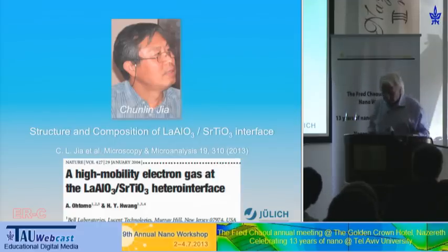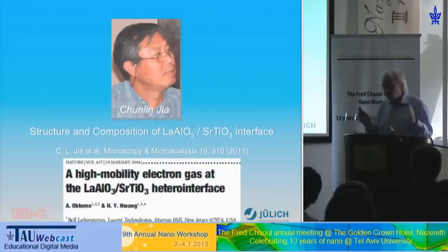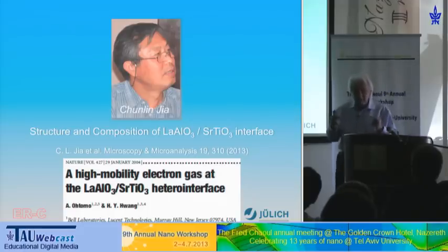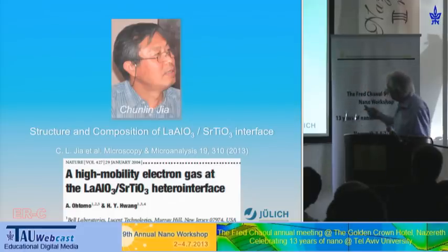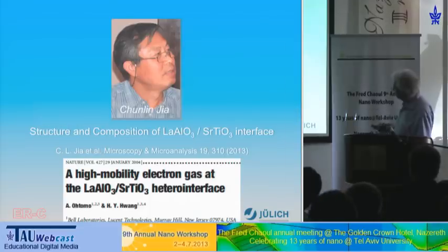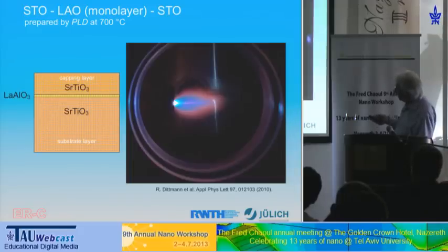So people have done a lot of work. There are hundreds of publications on this effect, but still there is no full agreement on what is behind this. Part of the reason is that people were not able to measure the properties on the atomic level. So we have recently done this type of experiment. We have investigated a single unit cell layer of lanthanum aluminate on strontium titanate.